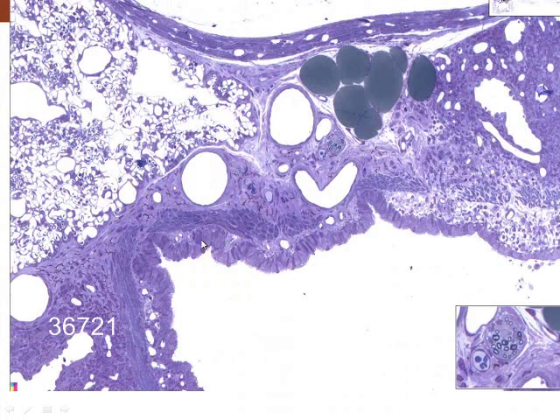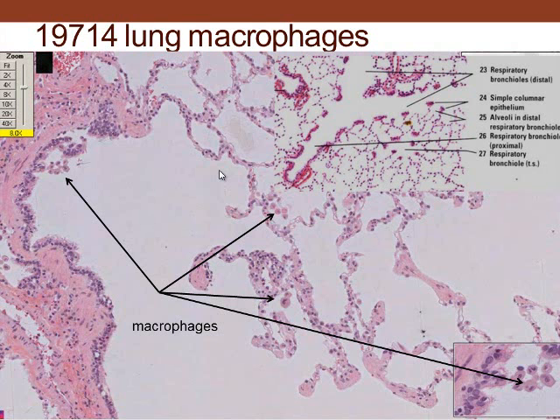Here we see a bronchiole, and here we see the nerve in through there, the perineurium, blood vessels, lipid, lymphoidal tissue in through there, lymphoidal nodule, smooth muscle, respiratory epithelium. These would be probably terminal bronchioles in through there, respiratory bronchiole here with a little outpocketing in through there, alveolar duct, alveolar sacs, alveoli that we will see in there.